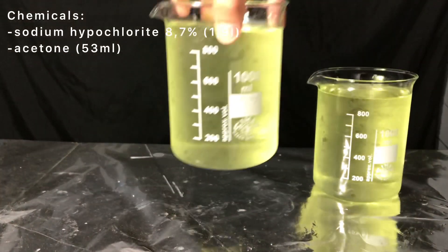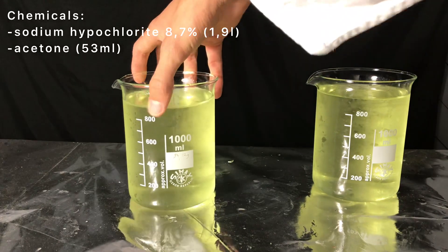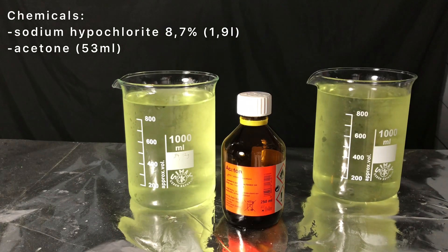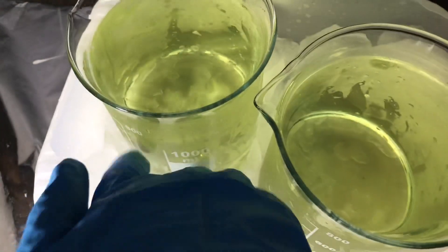Welcome back everyone. Today we are going to make chloroform. For this, 1.9 liters of 8.7% sodium hypochlorite solution and 53 milliliters of acetone are needed.